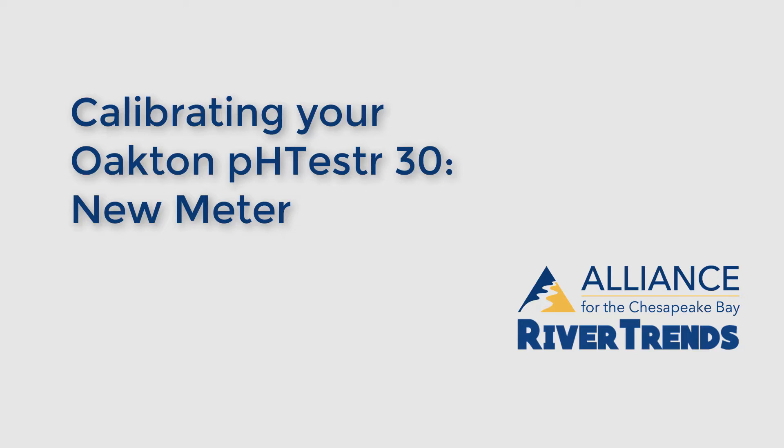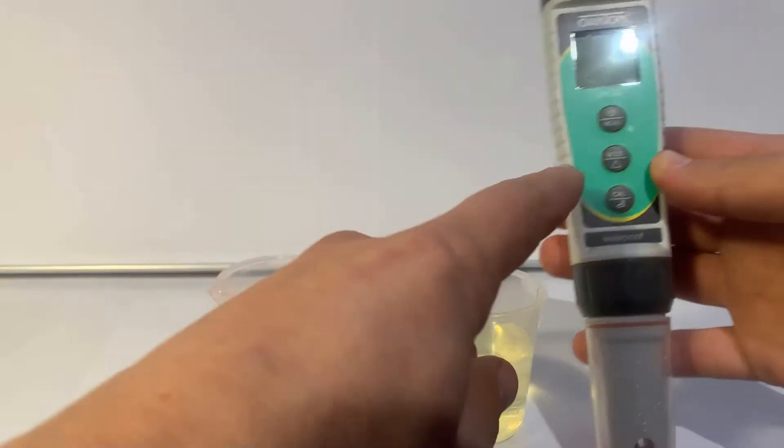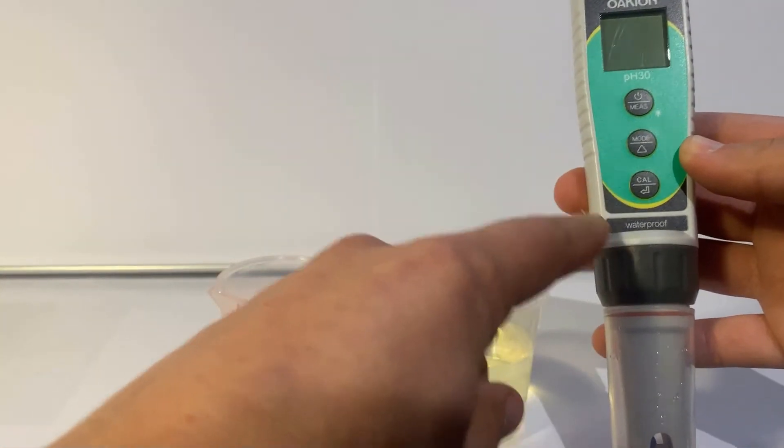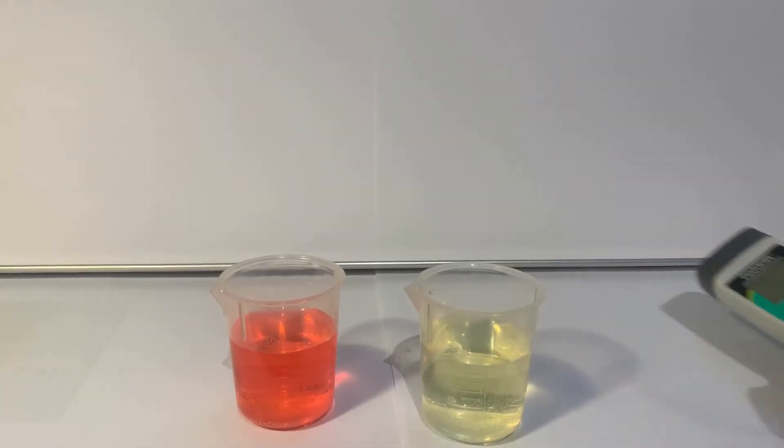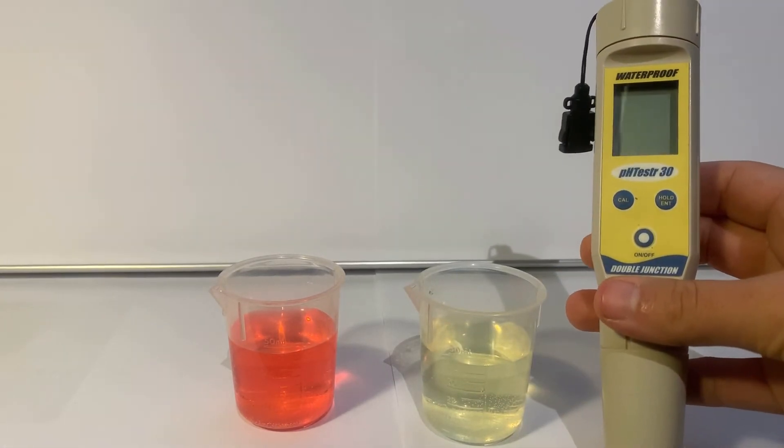This video will cover how to calibrate and use the new version of the Oakden PH30 tester, which has three vertical buttons on the front of the meter. If you're using the old meter with the buttons that form a triangle, use the video labeled older meter on the River Trends resource page.